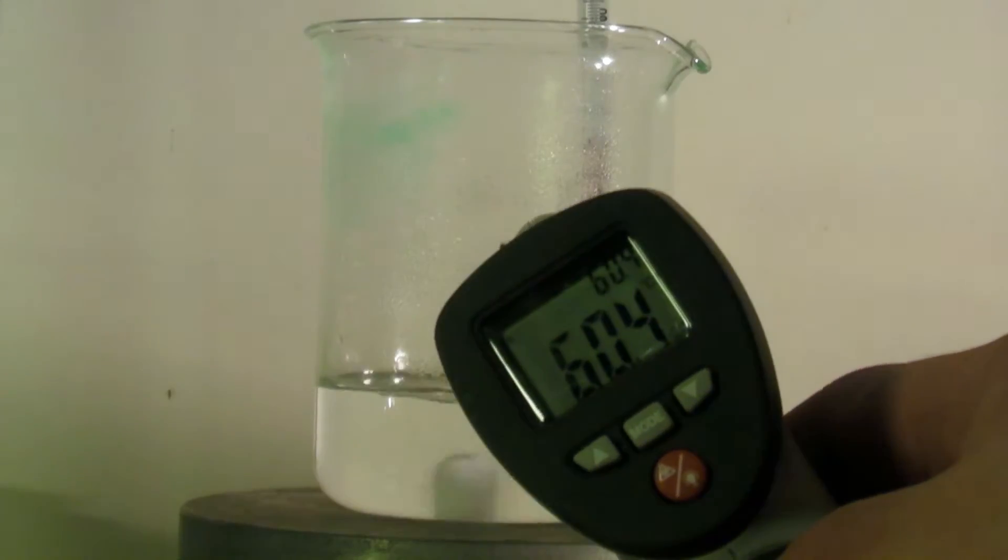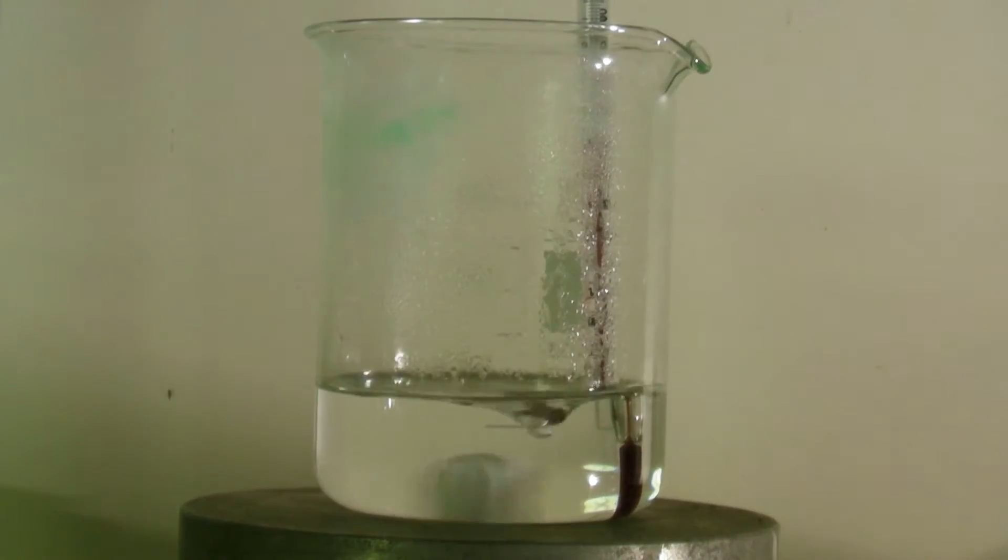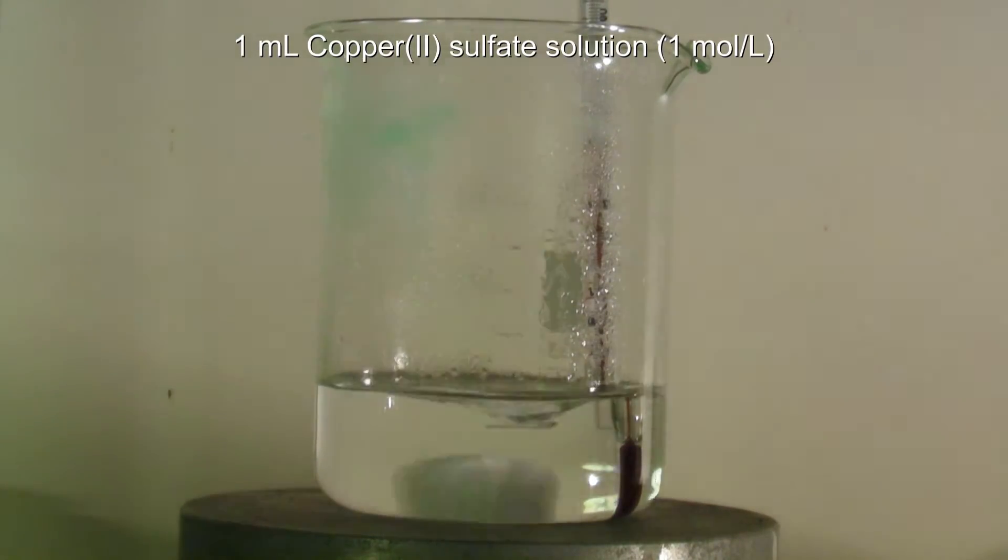When the solution has reached 60 degrees, 1 milliliter of a 1 molar watery solution of copper 2 sulfate is added while stirring vigorously.